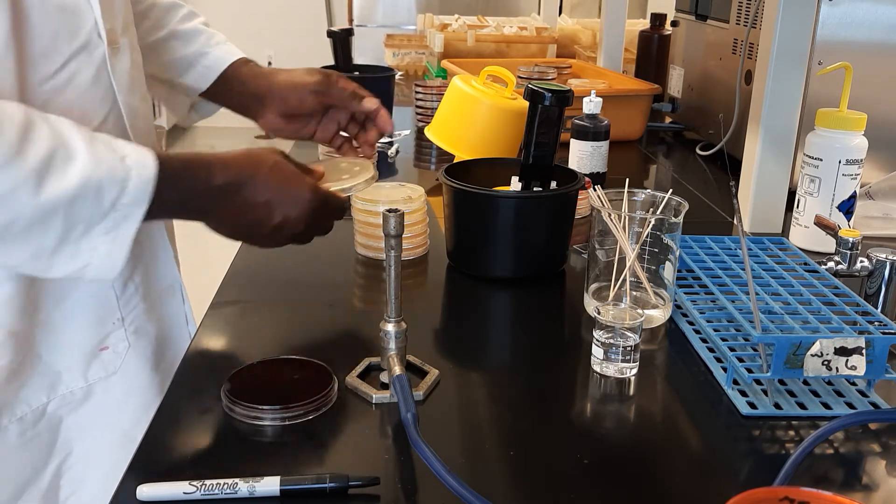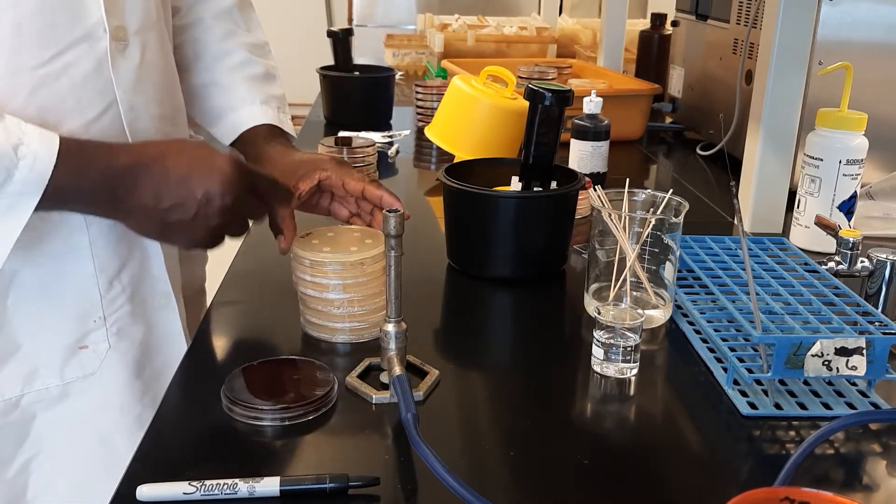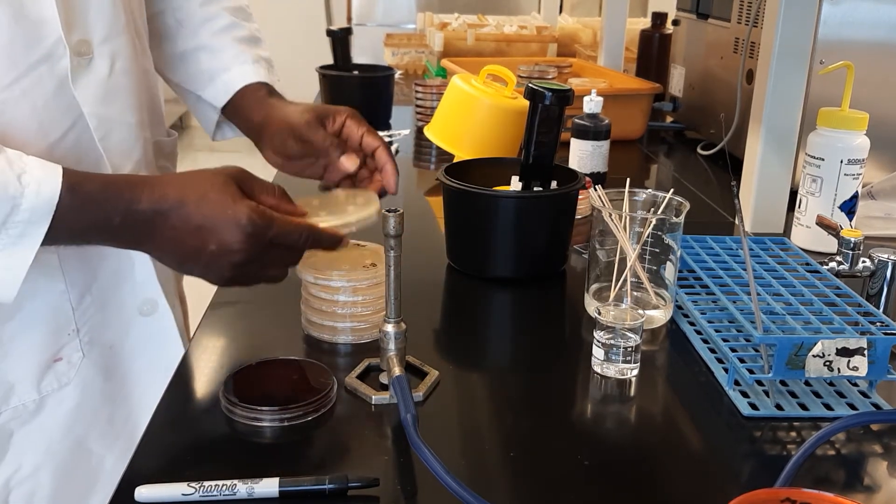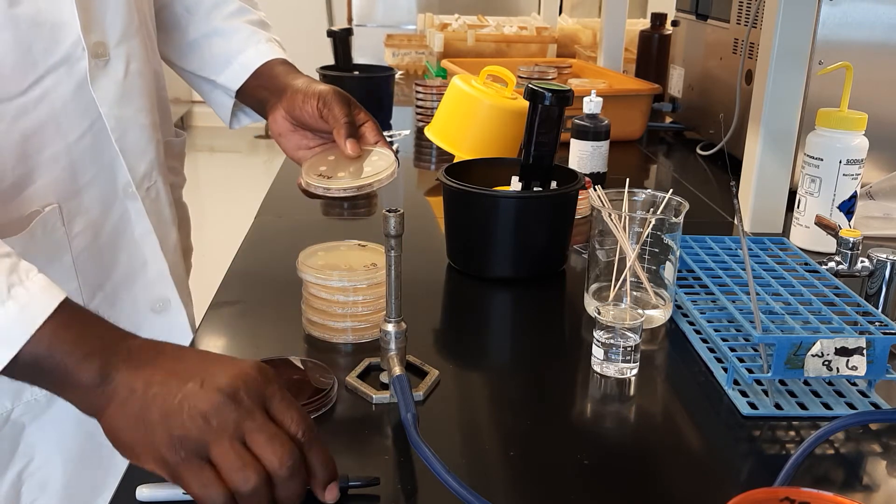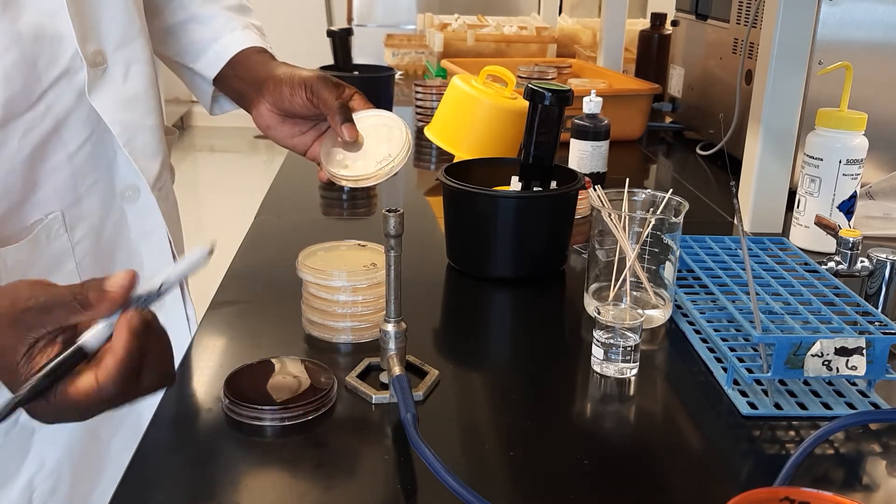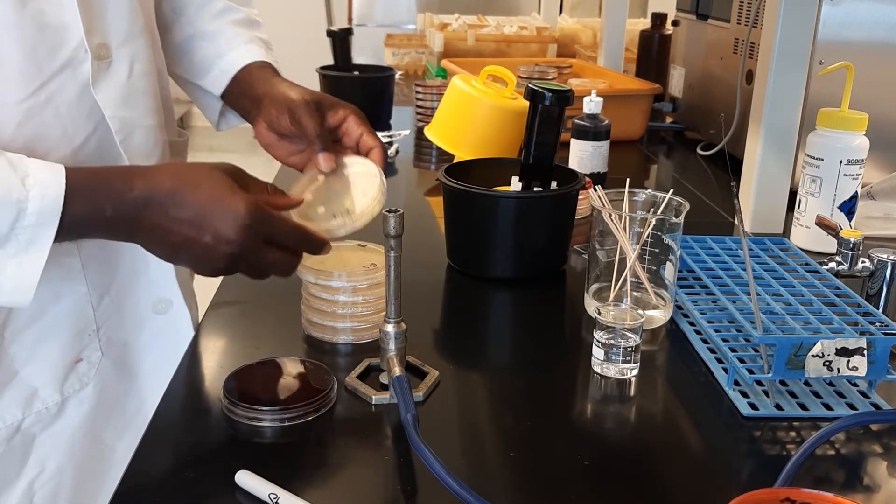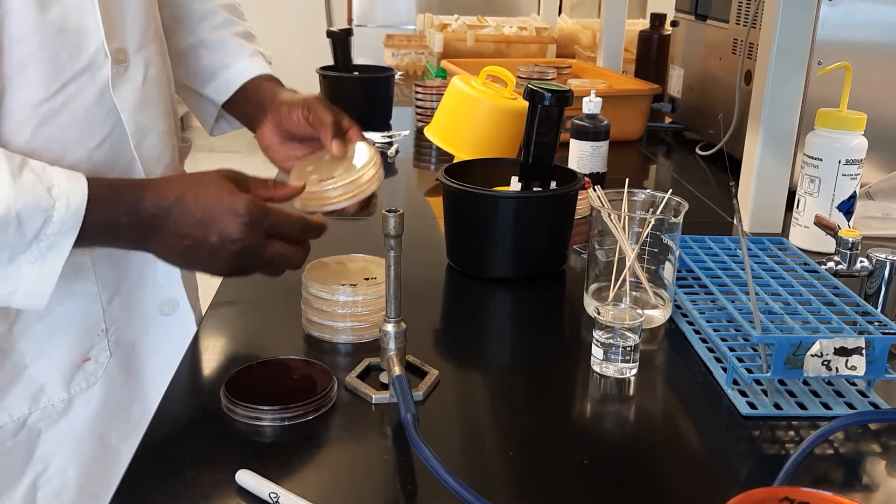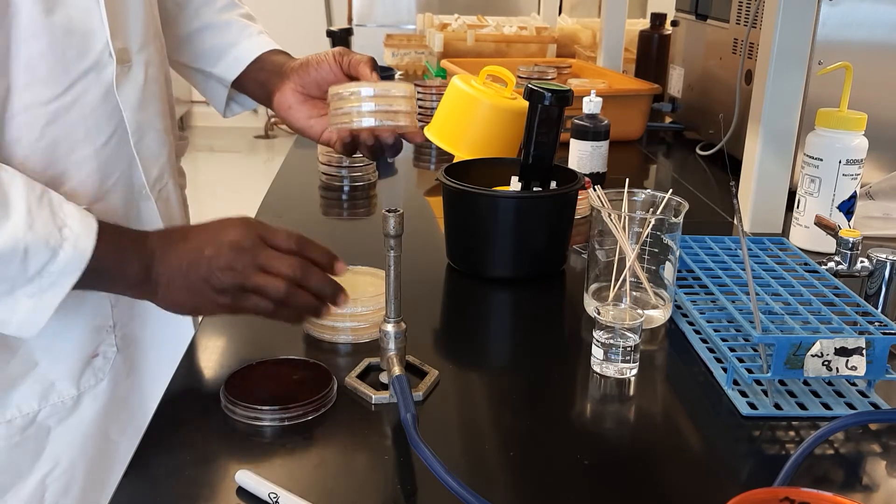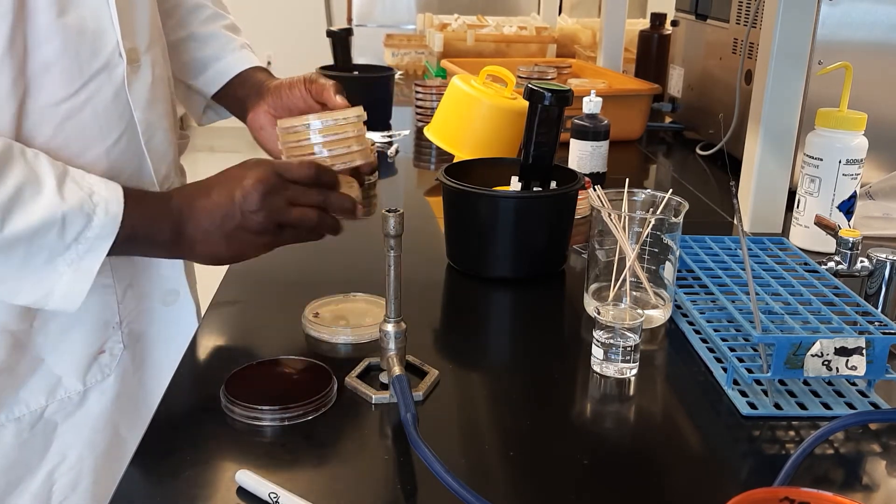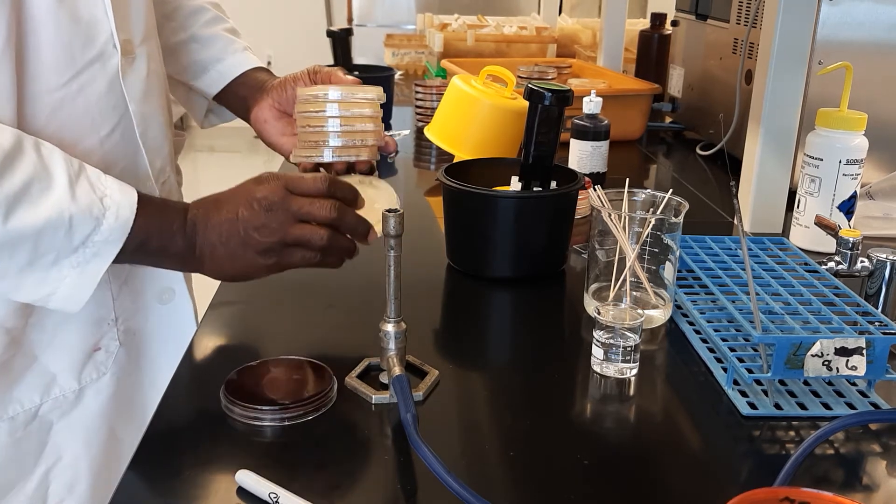Now that we have applied the disc, the next thing is to incubate. I did that previously, so now we should be able to see the effect of—actually, let me write BS for Bacillus subtilis. So we should be able to see the effect of these antibiotics on Micrococcus, Bacillus subtilis, Pseudomonas, Staph aureus, and E. coli.